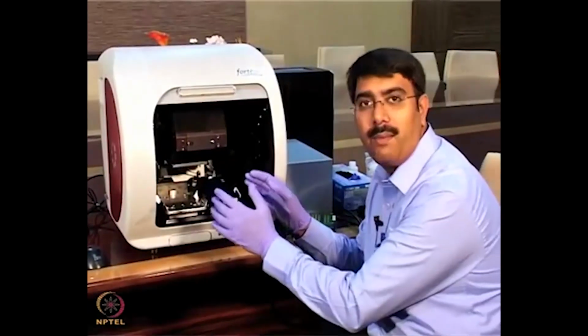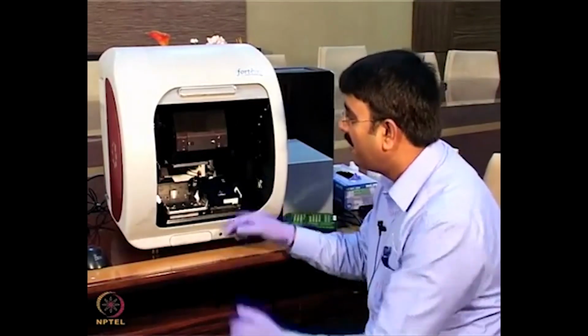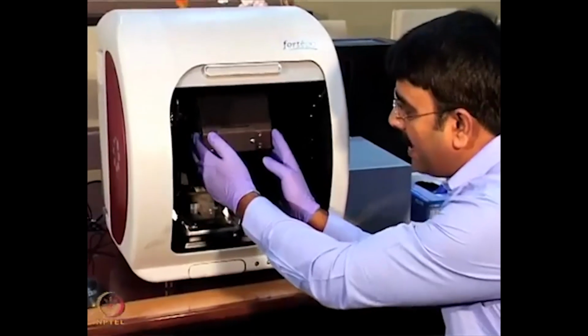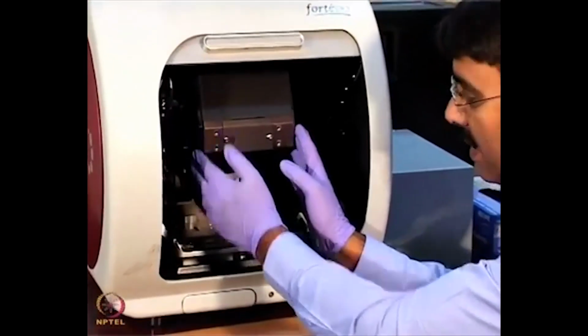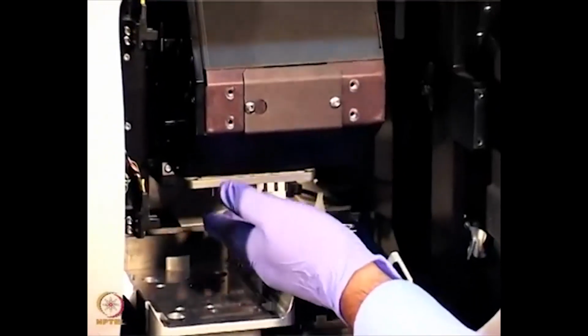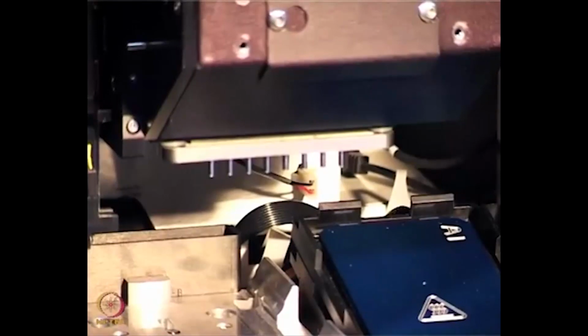This is the Pall FortéBio Octet RED96 instrument. If you look inside, we call this the optical head box. The optical head box consists of a spectrophotometer as well as the channels, which we call a manifold. This is an 8 channel manifold, so it can take up 8 sensors.